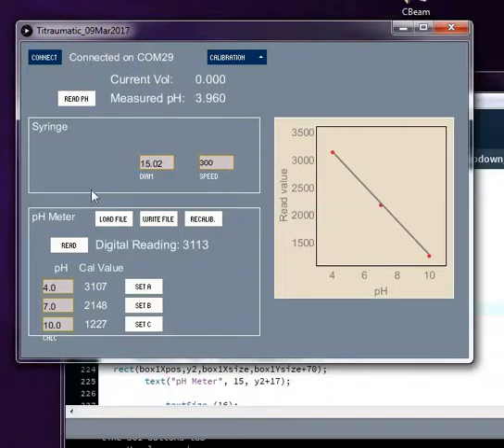Okay, on this screen we can select the diameter of the plunger for the syringe, and you can change this. You can change that, let's say 211. I believe that's the limit, the third place. This is in millimeters. So we're currently telling it that the diameter of the syringe is 15.211 millimeters. And of course, you can calibrate your syringes this way.